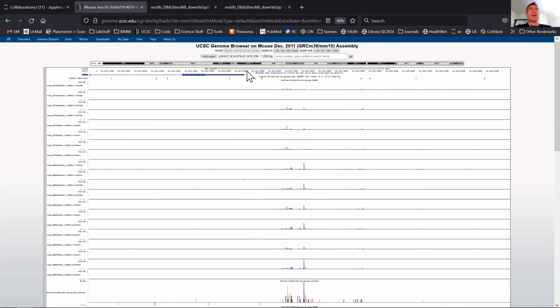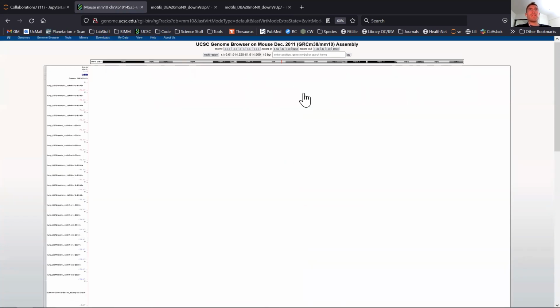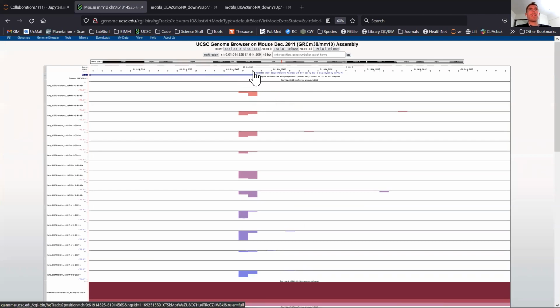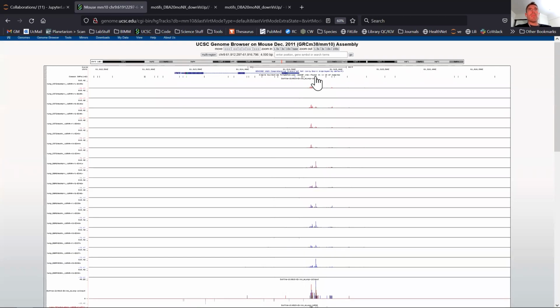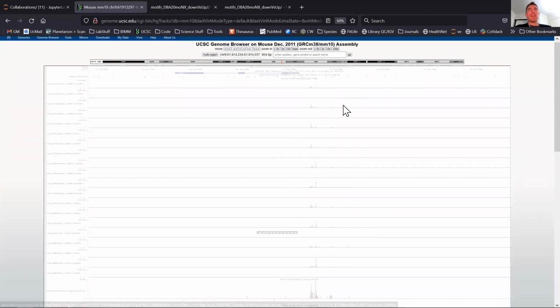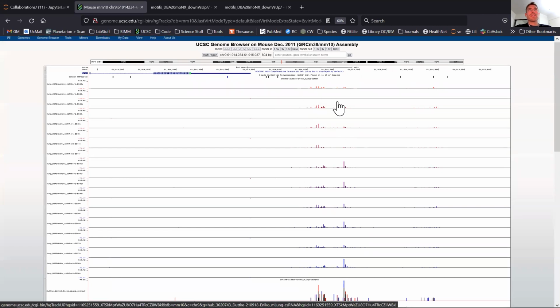And indeed, the gene is a very focused promoter that starts on this CA in mice. And yes, we have this start site that is nicely found in our csRNA-seq samples. But what actually dominates in this area is this downstream enhancer. And you can see these are unstable start sites that go in a different direction.